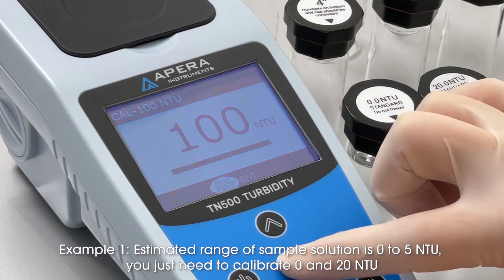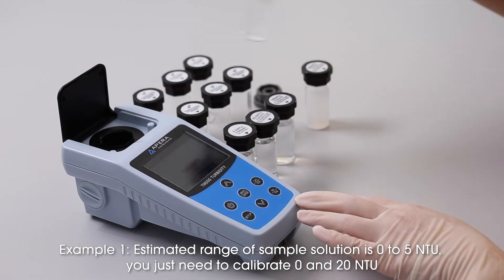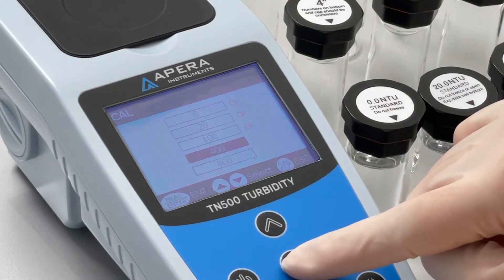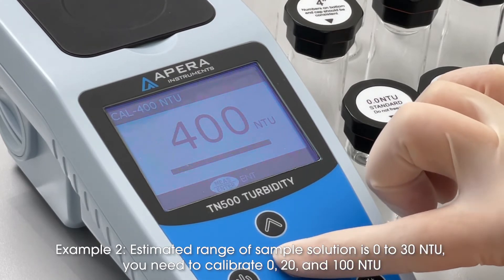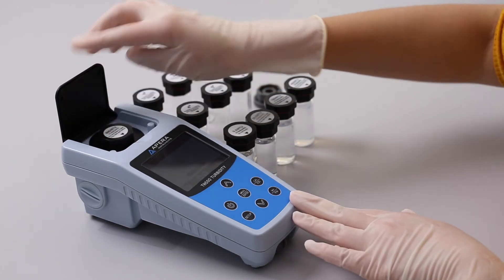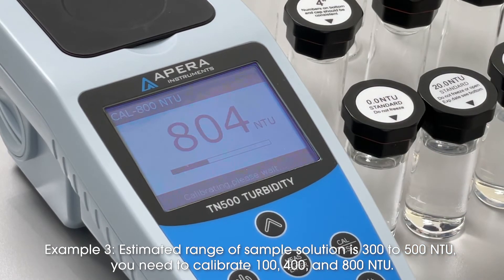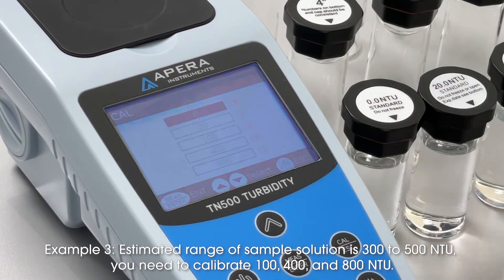Example 1: estimated range of sample solution is 0 to 5 NTU — you just need to calibrate 0 and 20 NTU. Example 2: estimated range is 0 to 30 NTU — you need to calibrate 0, 20, and 100 NTU. Example 3: estimated range is 300 to 500 NTU — you need to calibrate 100, 400, and 800 NTU.